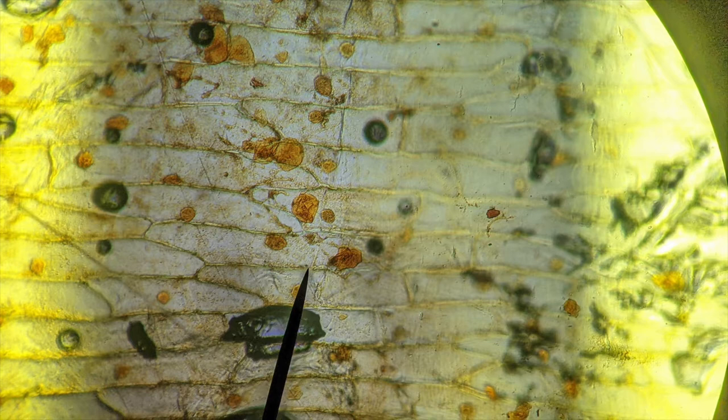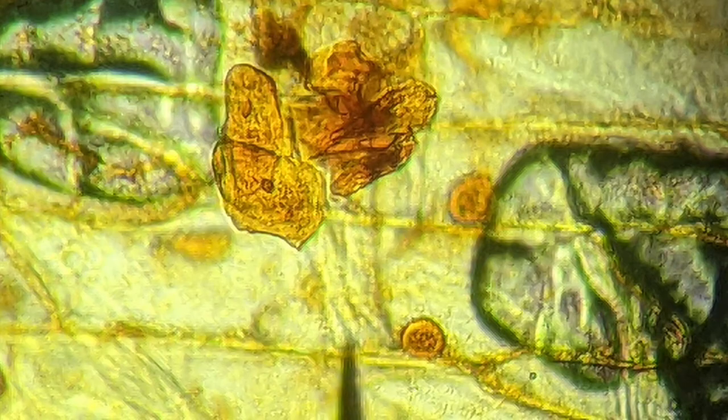This one millimeter mark can be used to measure the average length and width of an onion cell. From there, we can also use it to measure the length and width of the cheek cells, and we can even compare the nuclei of the onion cells to the nuclei of the cheek cells.